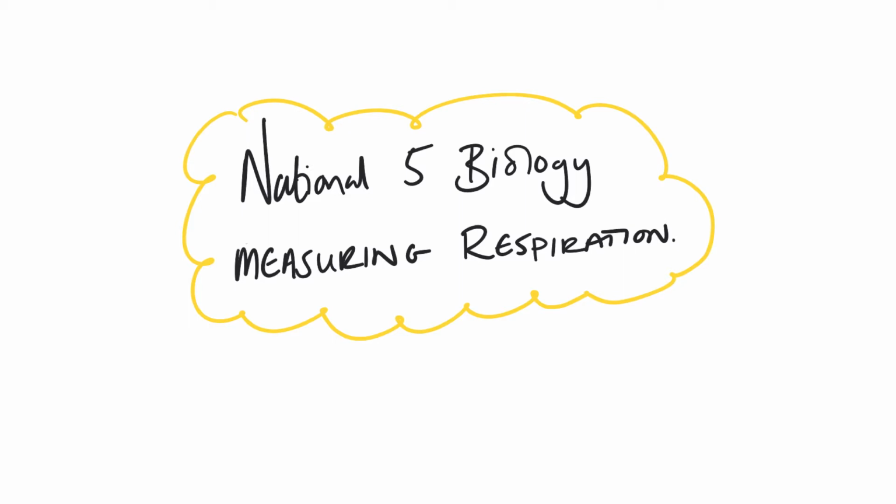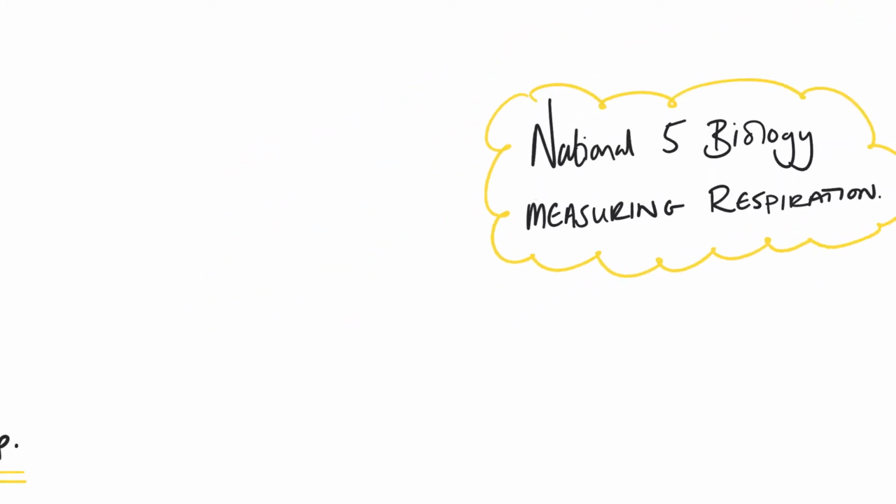This little video is going to take you through a little recap on the process of respiration and the level of detail you need to know for National 5, and then the experimental techniques we can use to measure the rates of respiration and some of the features of that kind of setup that will help you tackle some questions at National 5. So, here is your recap.